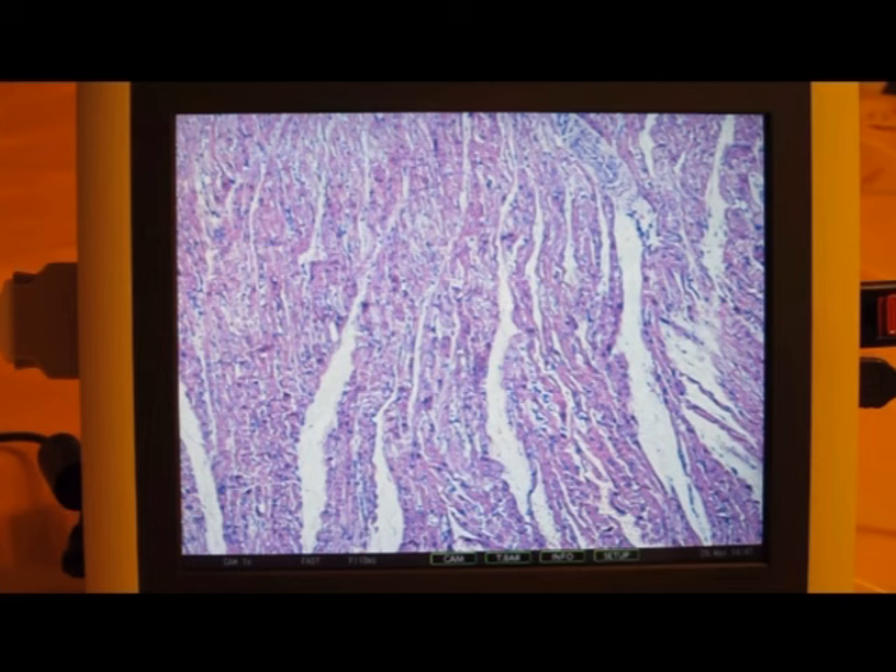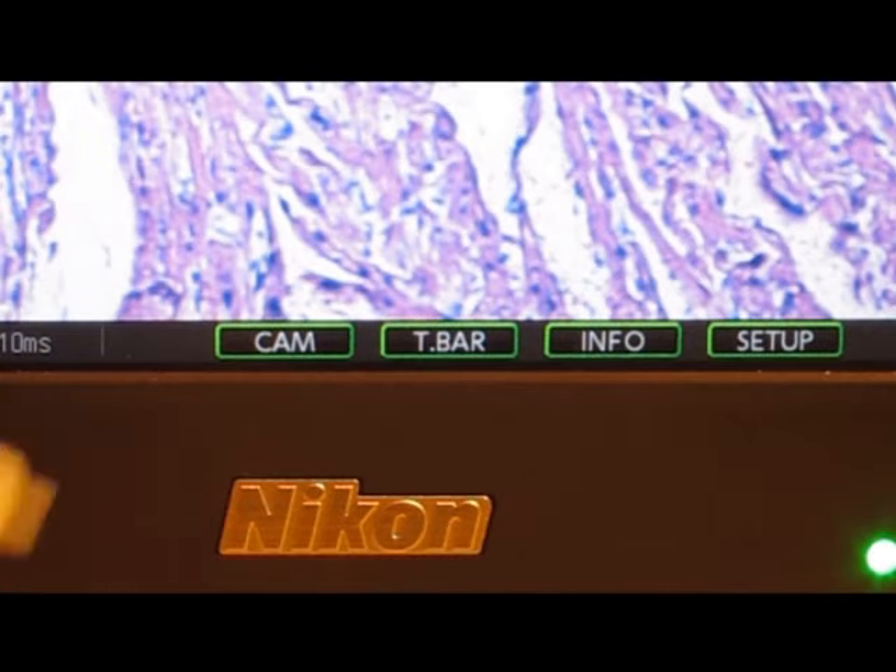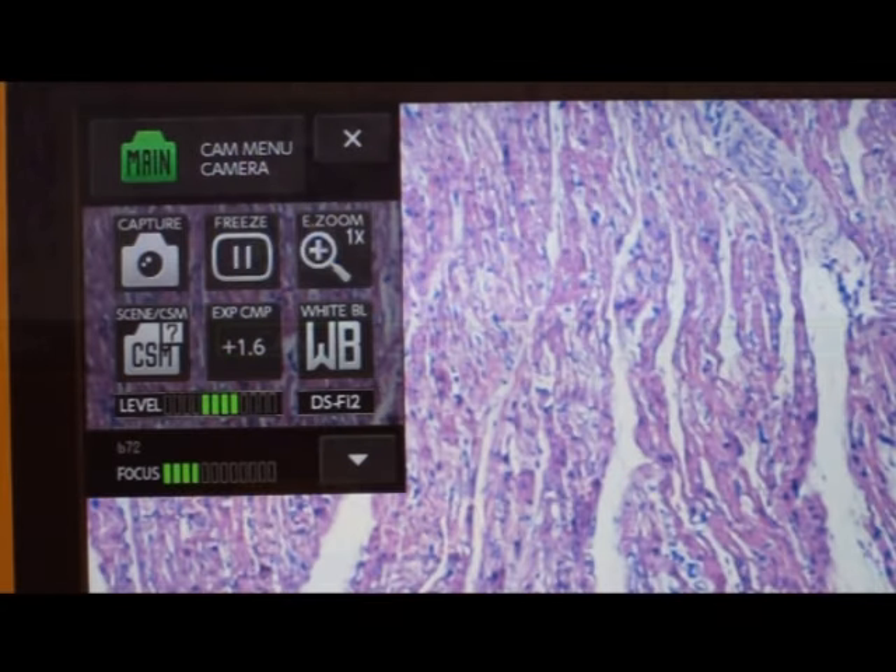The 7-inch touch screen can be used with a stylus or a mouse. To start, click or touch the camera icon on the bottom of the screen. This launches the main menu.